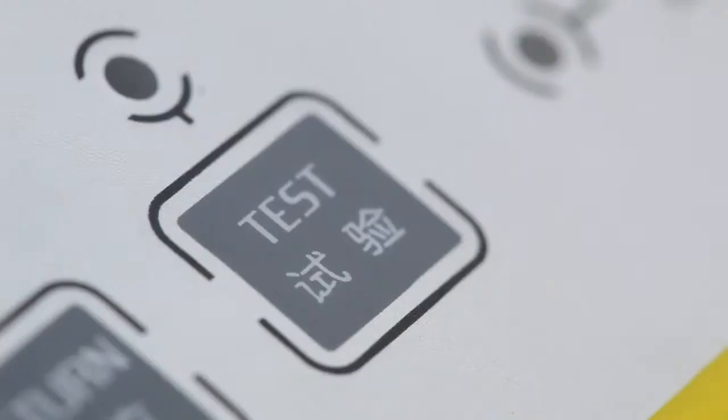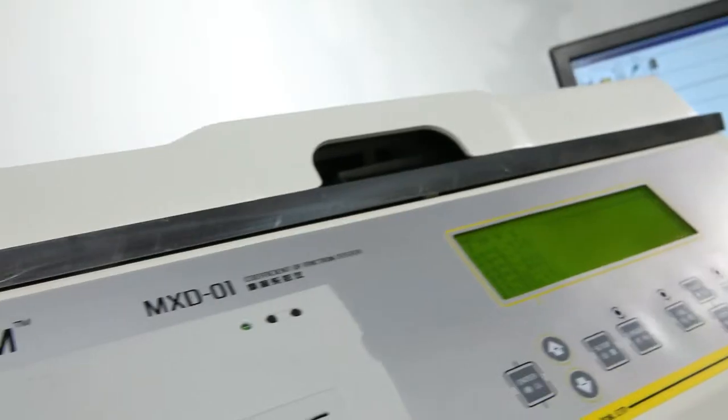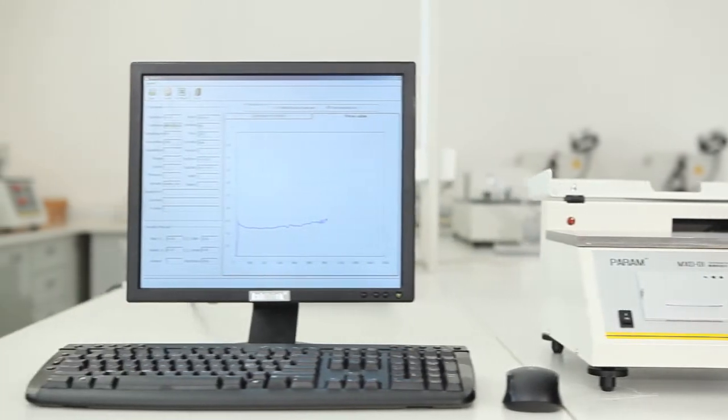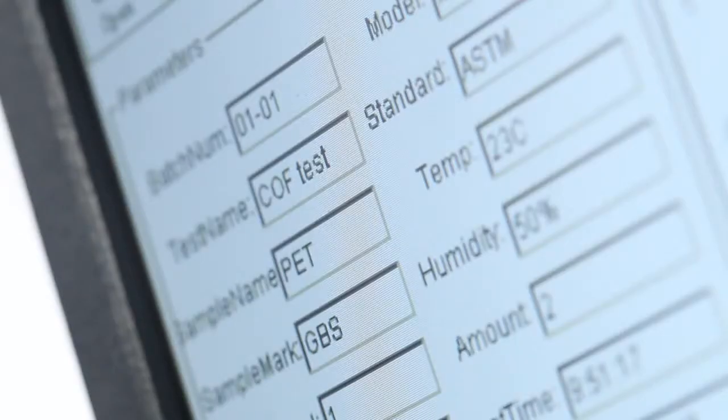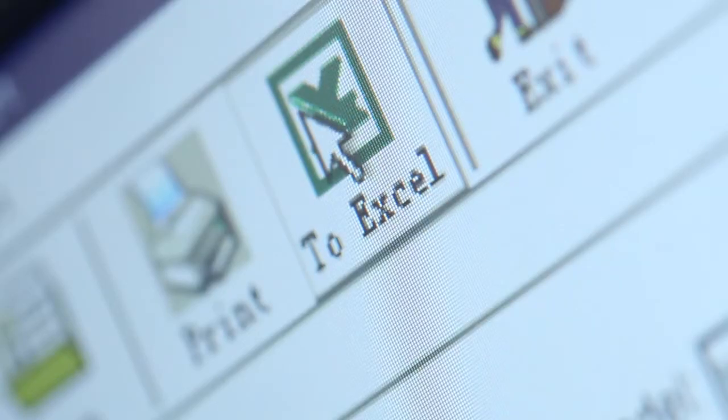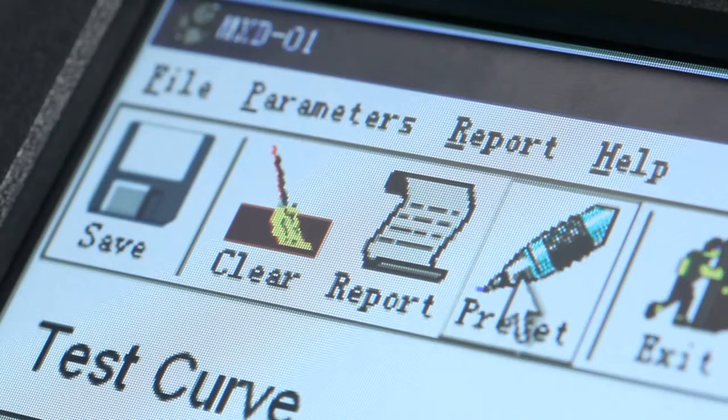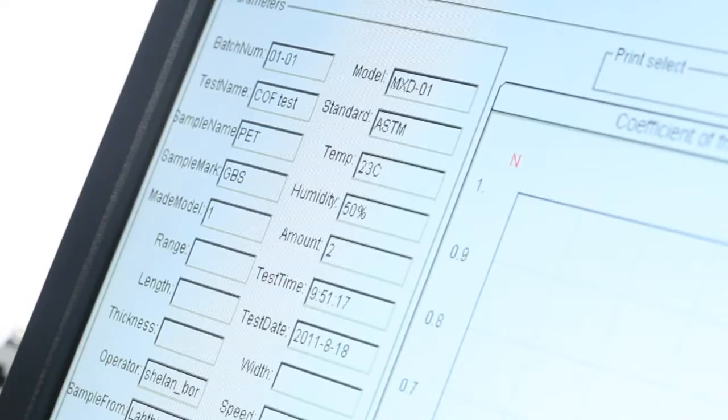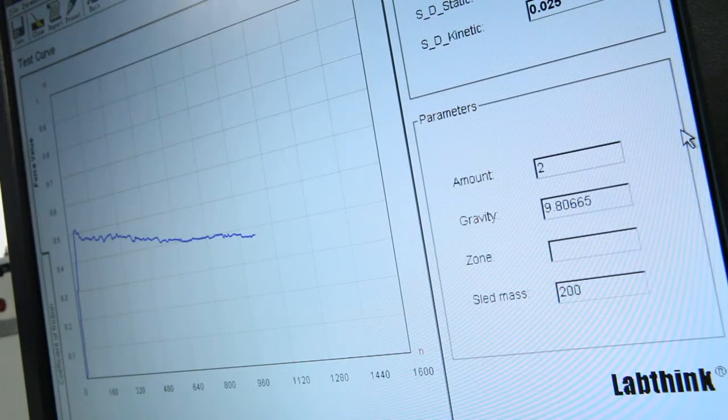This allows users to carry out tests without computers. The testing software designed by LabThink has an intuitive operation interface and visual display of real-time data and graphs. It supports Excel format data exporting and can perform statistical analysis of any single testing result or grouped sample testing results.